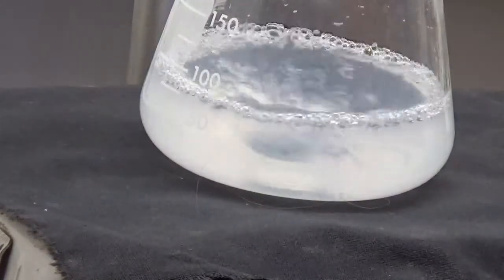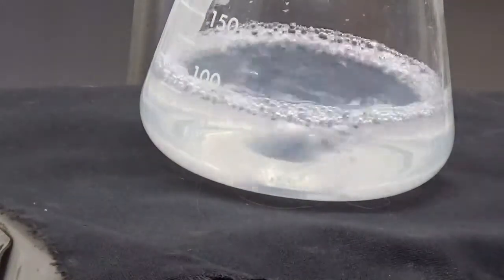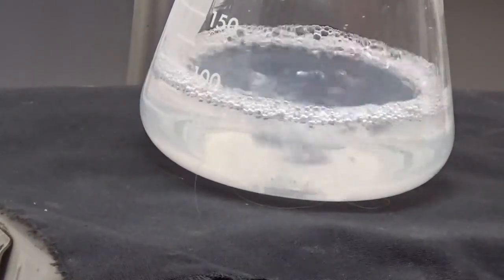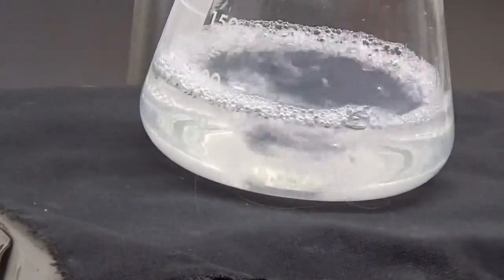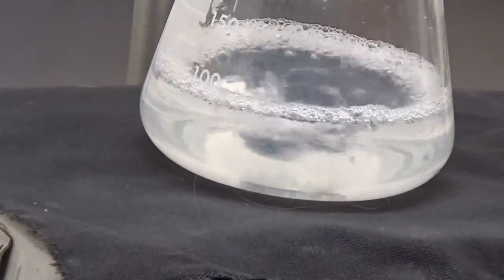But now I am, if not there, very close. It's just cleared up a lot, but I still see a little bit of cloudiness, which I don't really understand. It should either be cloudy or clear, but okay, there's one more drop. Just one more drop. It's been pretty clear, but it's got a little.